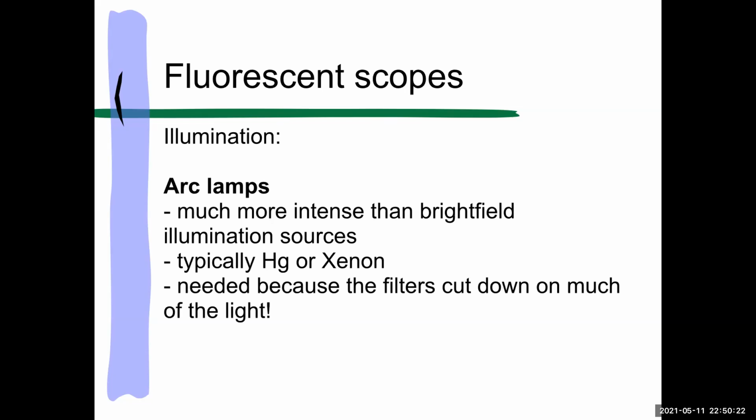They're delicate little things that require a lot of TLC, basically. And you have to make sure you know how old the bulb is and how many hours. Obviously the scope reps are telling you 200 hours, and most people are pushing them to 1,000 hours, but then you're kind of cutting it close. They get dimmer as they get older and so on.